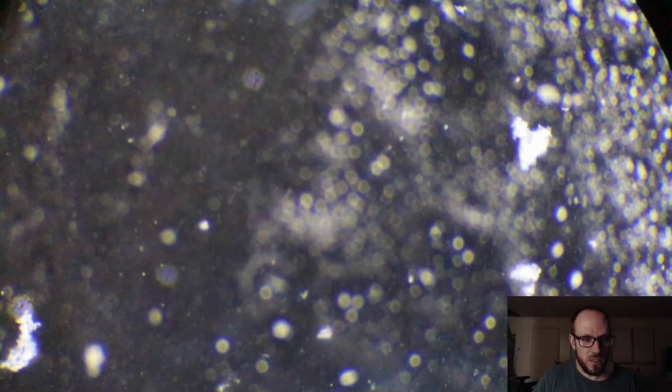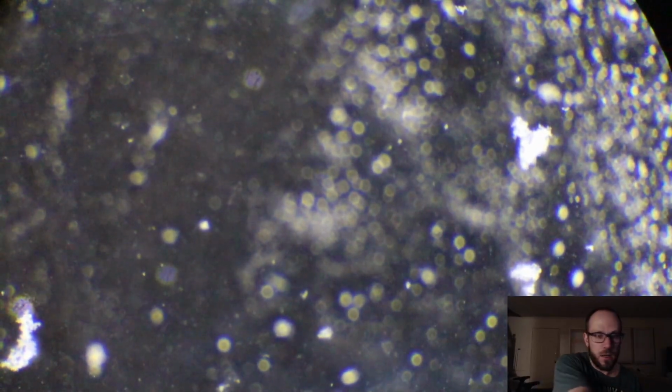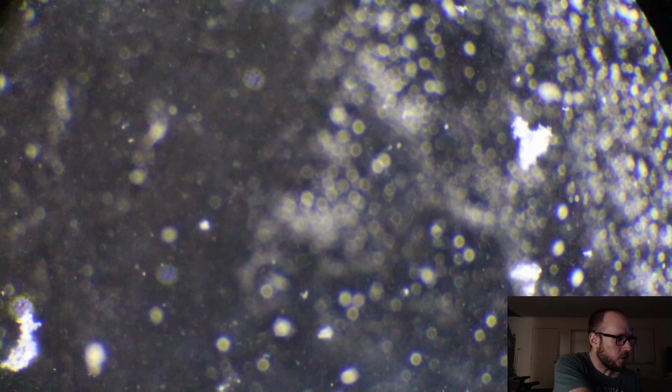So I took 2 samples from that. There's a layer of red water on the top, and this first sample that we're going to look at is from there. And then there's the clearer water below that. When I looked at the red water the other day, it was just thousands upon thousands of small organisms. So we'll see what we've got here. And what we've got is out of focus. So let's work on that.